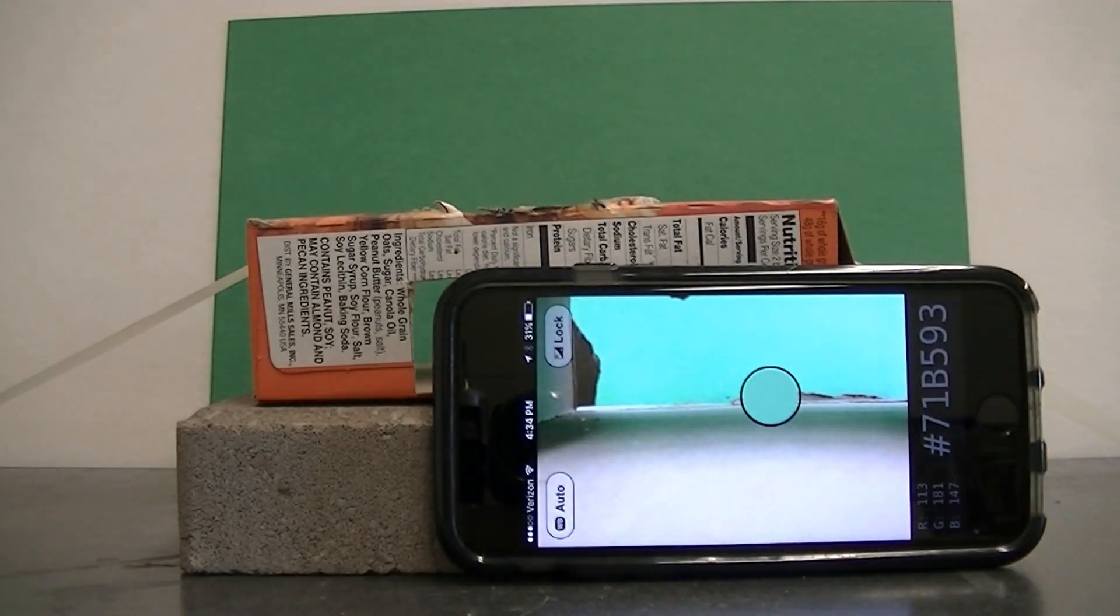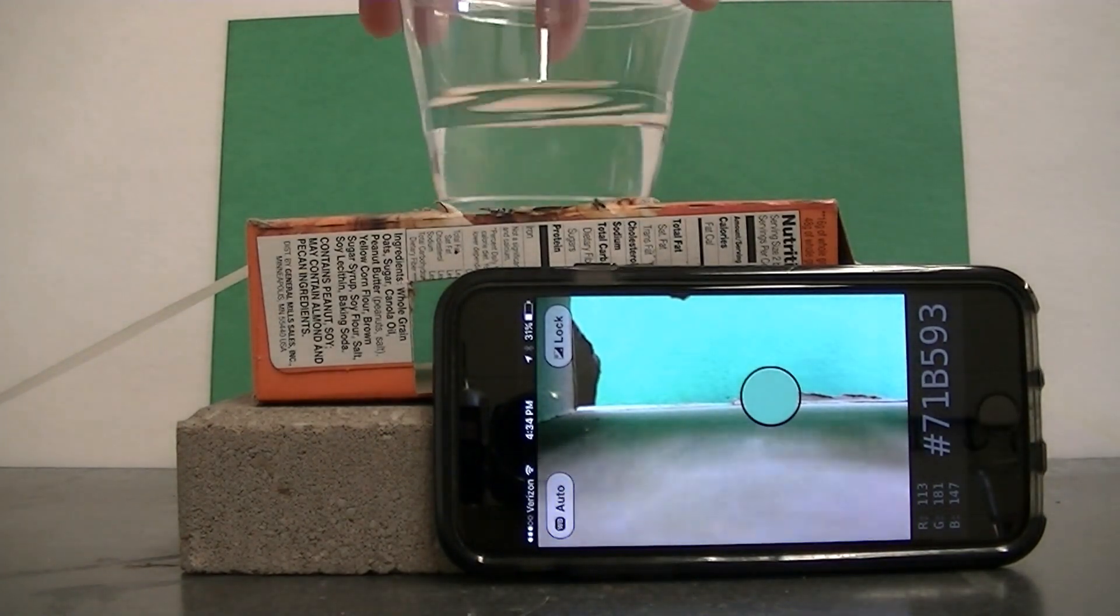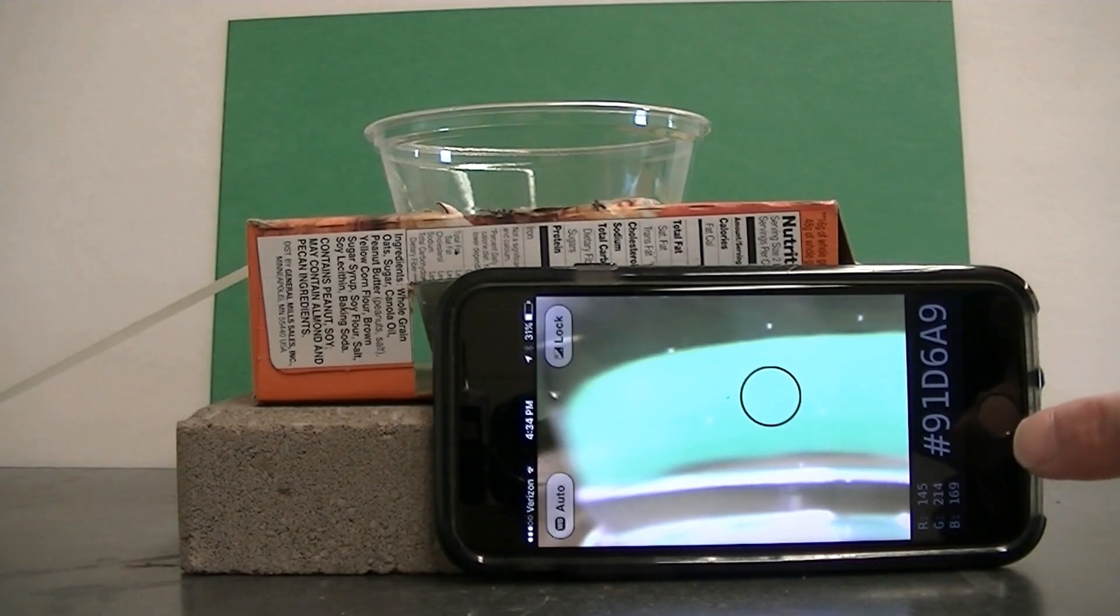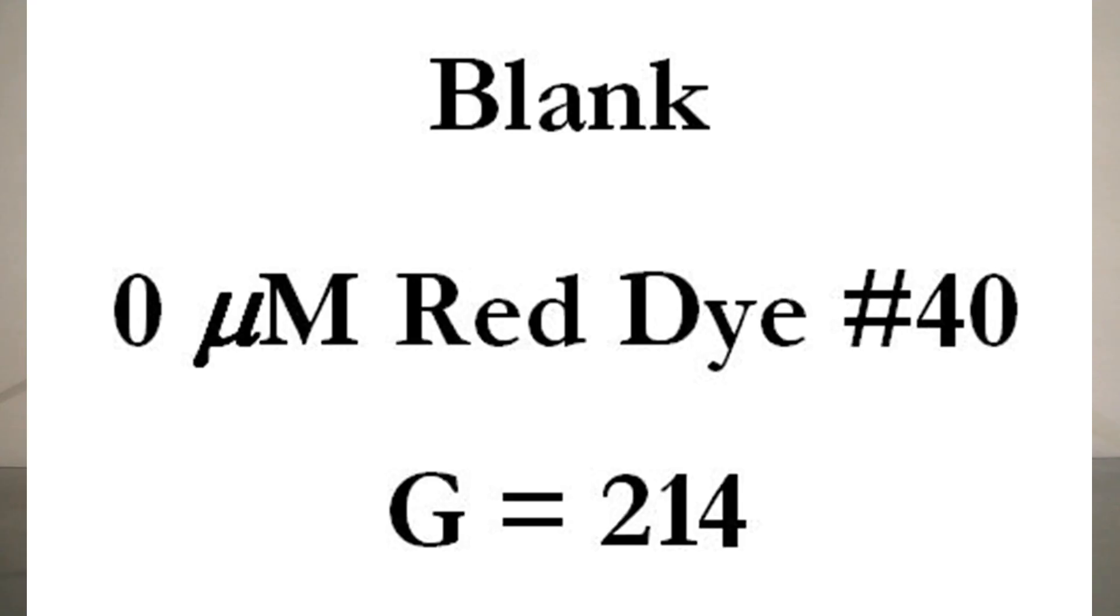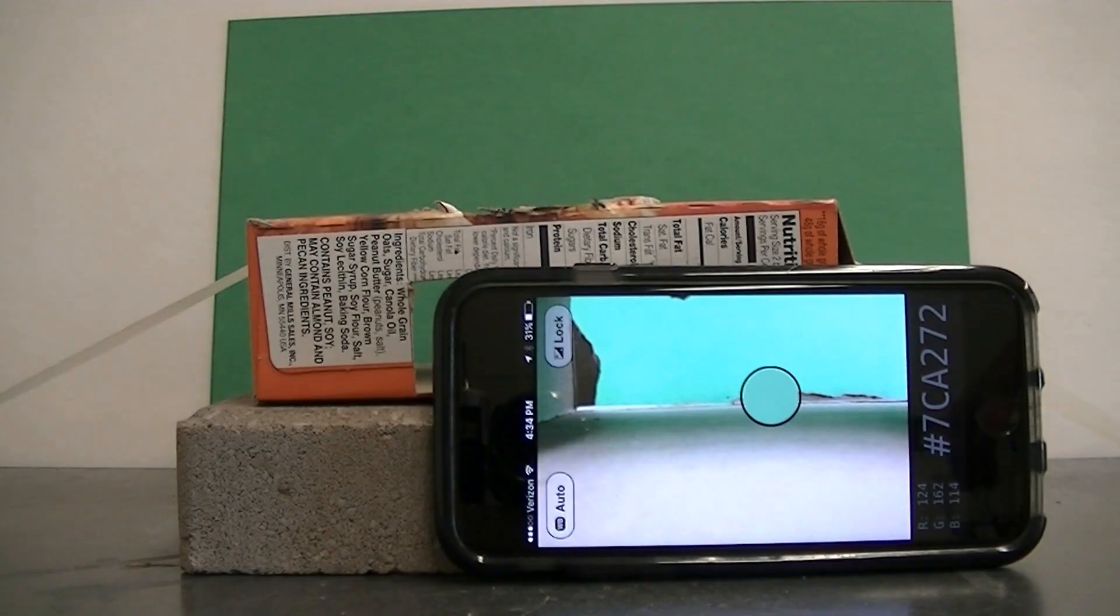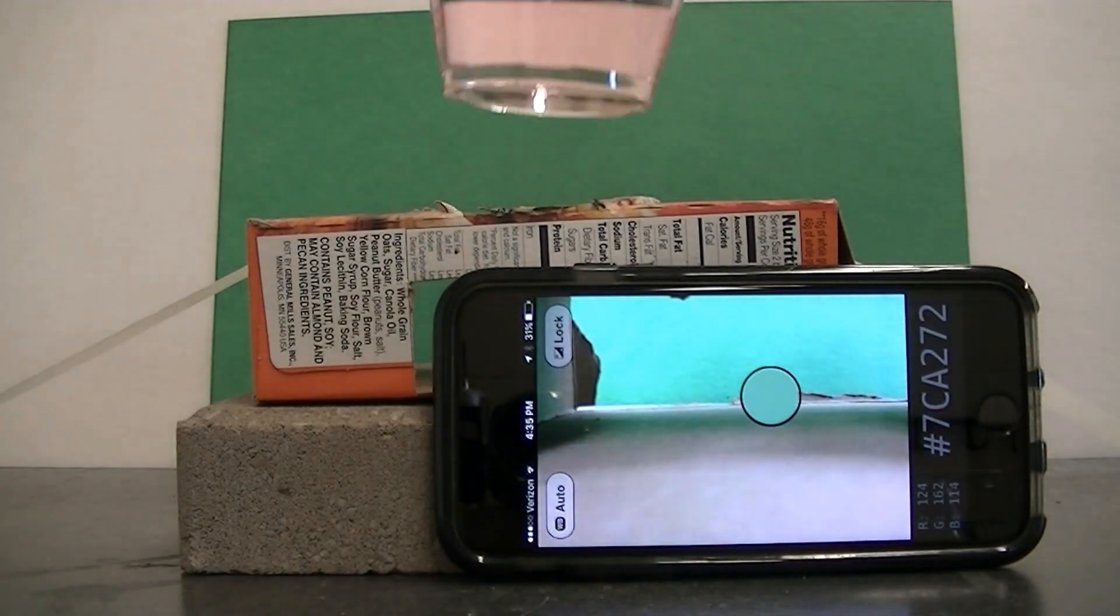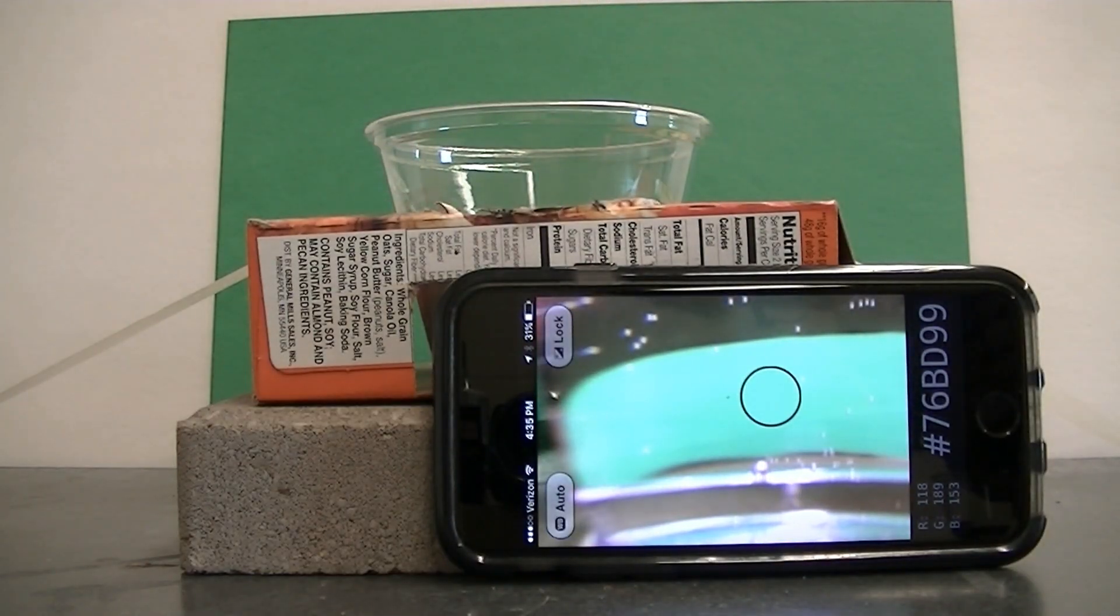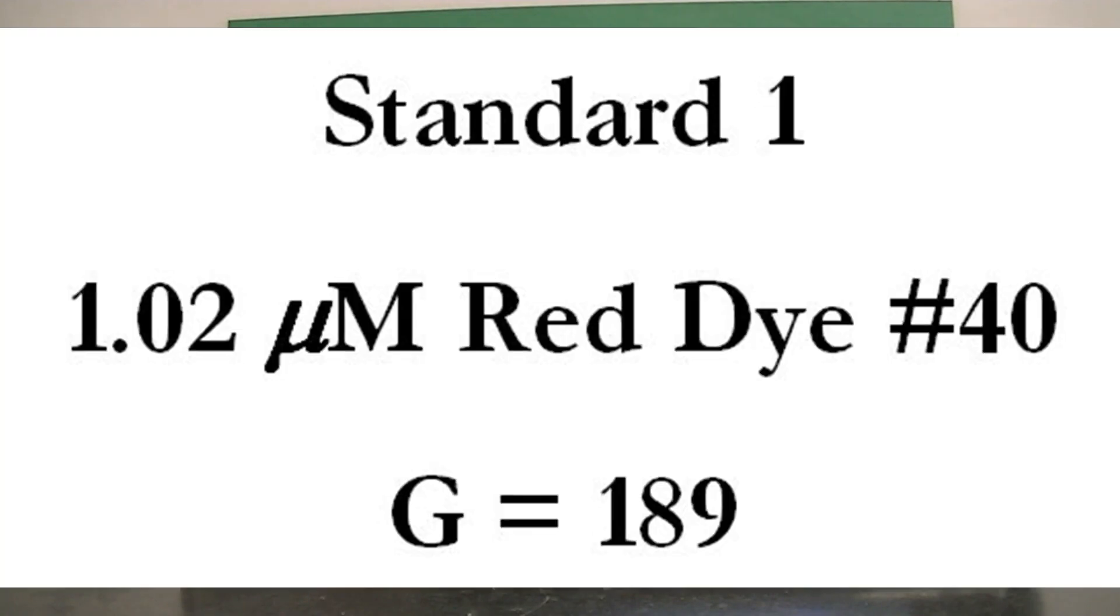Okay so first we're going to detect the green light that passes through our blank which is just water. And it looks like my green value is going to be 214 for the blank. Now I'm going to test my standards. And again my standards were made from the fruit punch Powerade Zero. This particular standard has a concentration of 1.02 micromolar red dye 40 and we can see that its green value is 189. So it looks like a little bit of that green light's been absorbed which we'd expect.